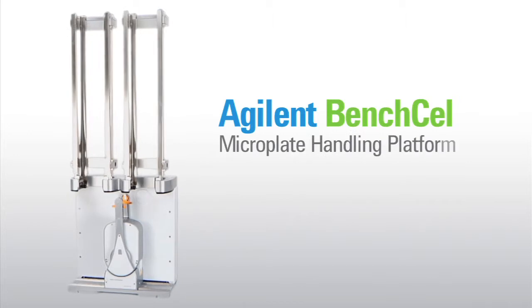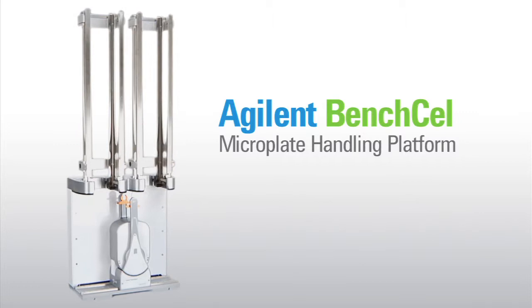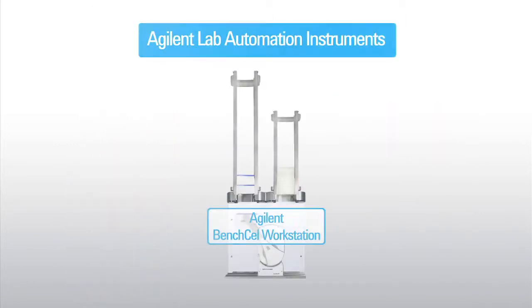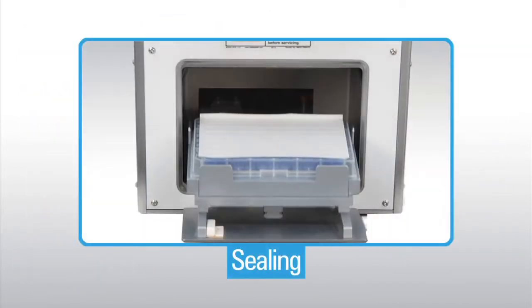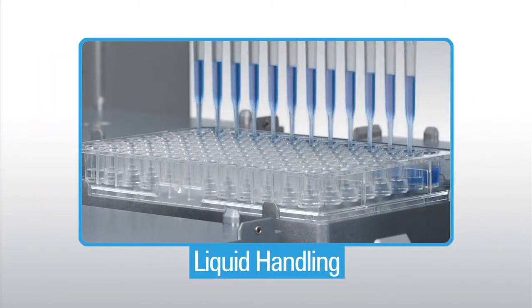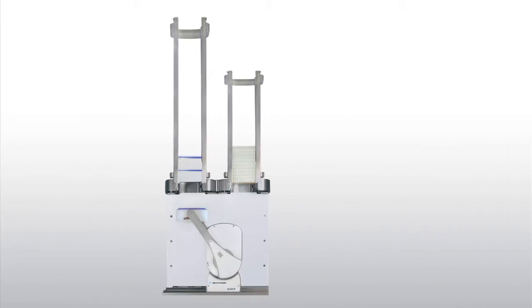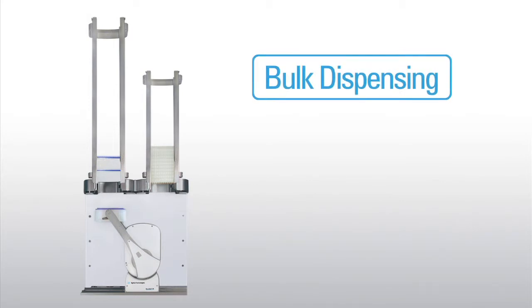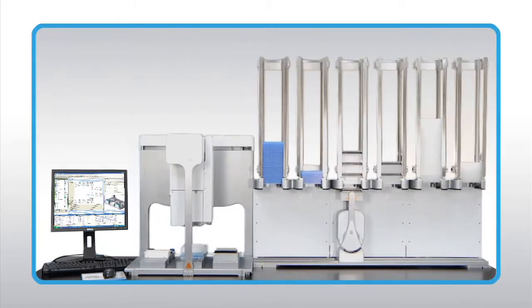The Agilent BenchCel Microplate Handler is a lab automation platform that can rescue labs from repetitive labware handling chores. The BenchCel is fully compatible with Agilent's range of lab automation instruments which provide functions such as sealing, labeling, centrifugation, and liquid handling, as well as automation support for third-party devices for enhanced throughput such as bulk dispensing, plate reading, washing, and incubation. BenchCel automates all of these activities and more.